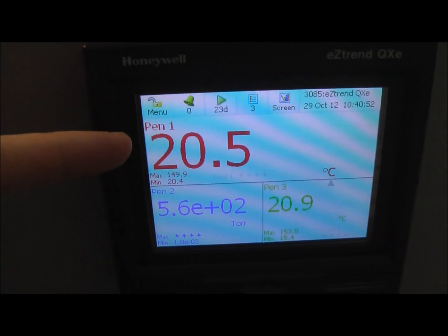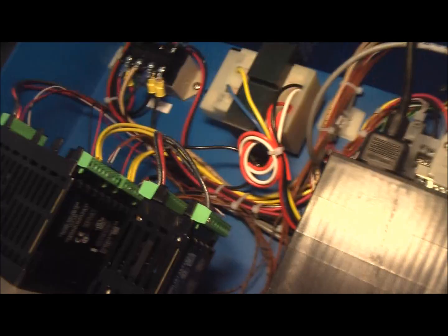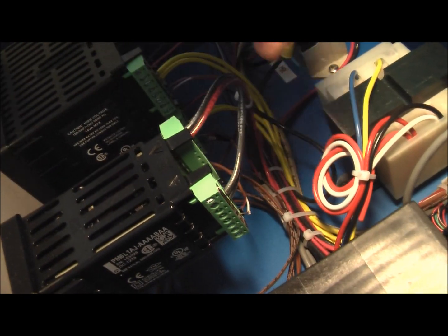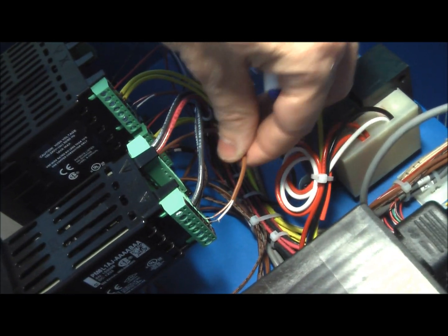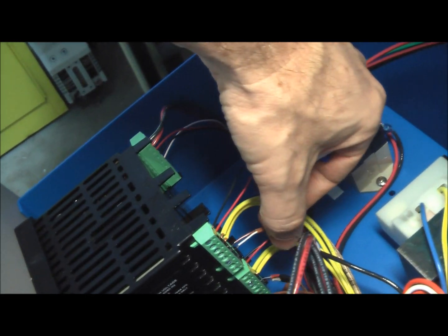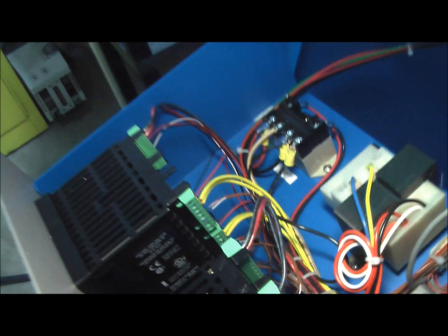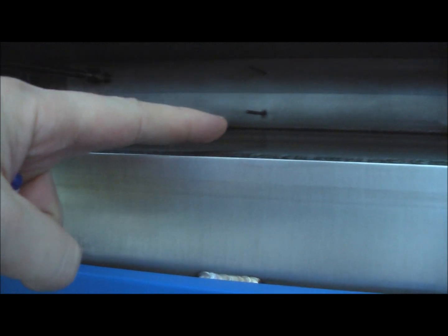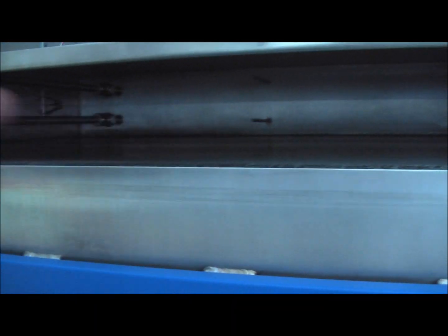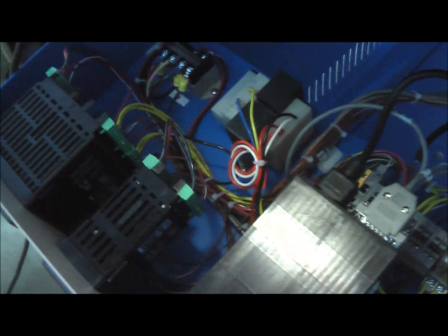We'll see here that we have 20.5, 20.6 — so we're within 0.1, a pretty good retransmit. Additionally, there's another thermocouple here into the over-temp device. This thermocouple goes to the over-temp, and this thermocouple goes to the main controller — the two light brown wires. These are together in the main probe inside the oven. Inside the oven on the thermocouple, there are two thermocouples inside that stainless steel sheath, and they come down and split into the over-temp and the main controller.